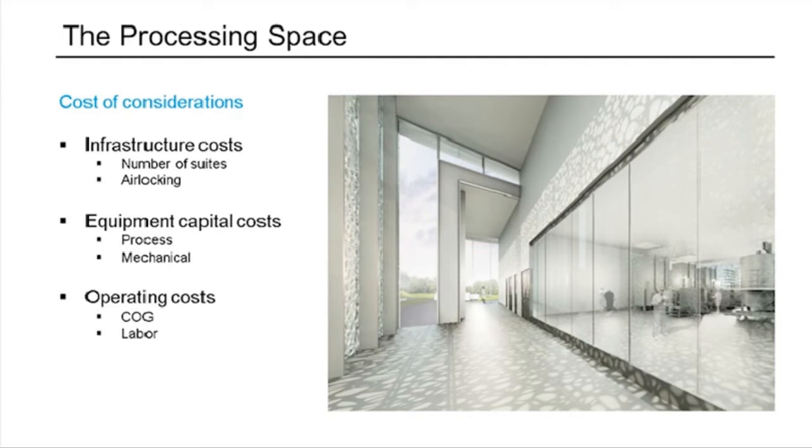And then in terms of equipment capital cost, certainly there's processing equipment that's going to be based on the number of systems and the system type that you have. When we talk about open operations, and these are things like incubators and biosafety cabinets and centrifuges, not a very heavy cost there, versus closed automated systems tend to be a lot more expensive because they are a lot more complicated.